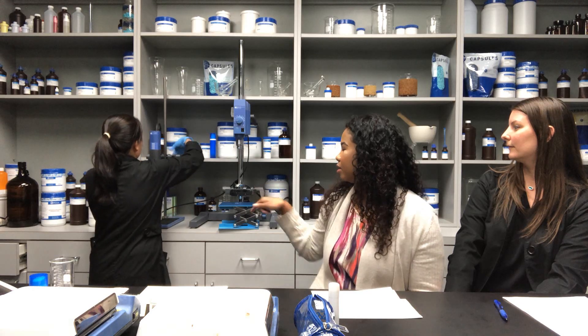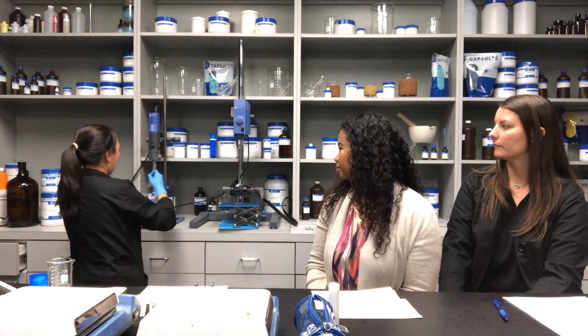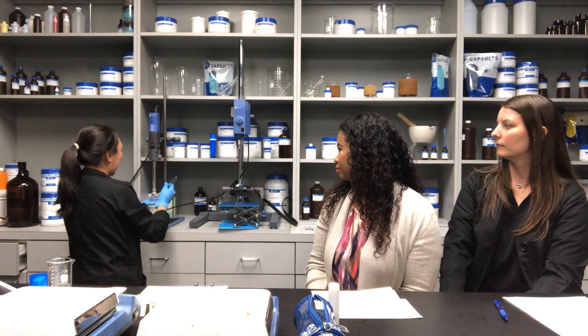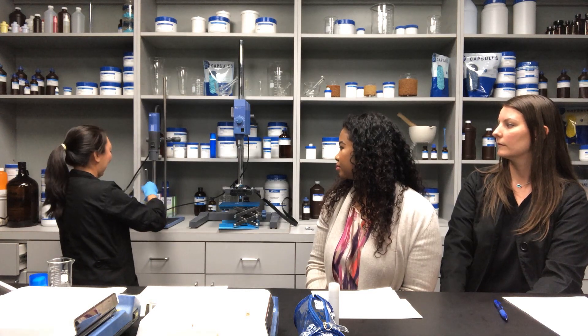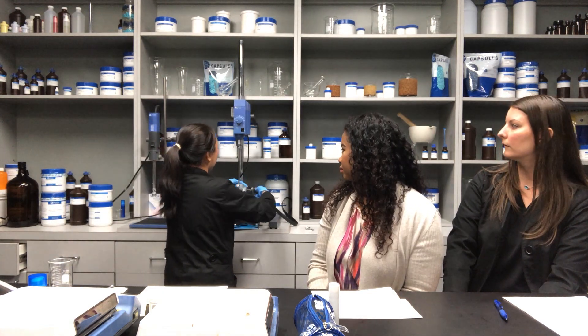About how long does that step take? It depends on the formula. This particular one, because it's thinner and has a good emulsifier in it, is only a few seconds. You don't want to do it too long or it'll start foaming up. I'll put this on the mixer and then we can talk about why this is different.